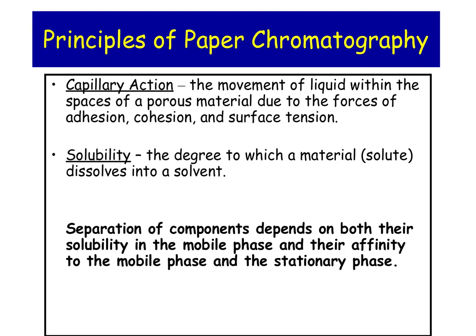So the way chromatography, and specifically paper chromatography, works is you have a sample that is placed on a sheet of paper. So imagine like this on the side. You put your little sample here. And what happens is you stick the very bottom of that sample in water. So imagine this is in a big beaker of water here. Okay. That water will trickle up through the paper because we all know that paper is absorbent.